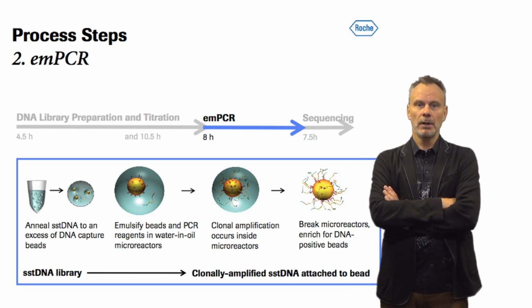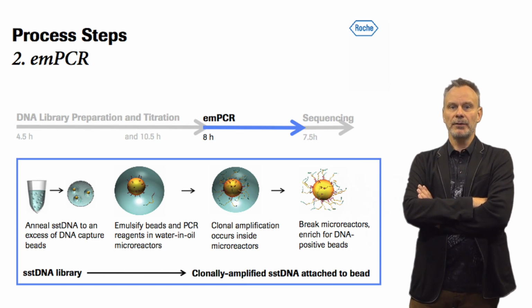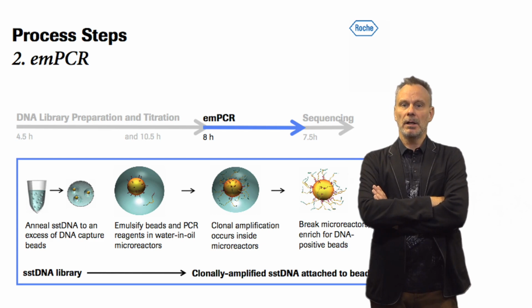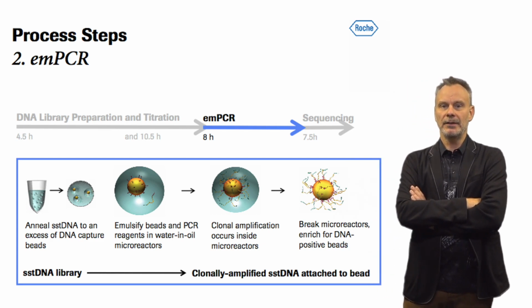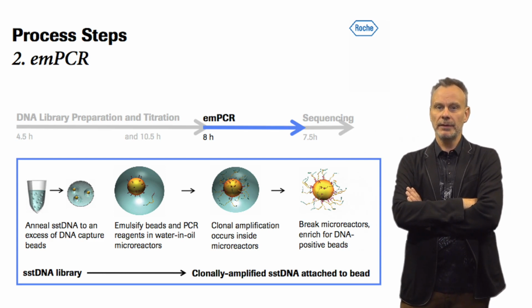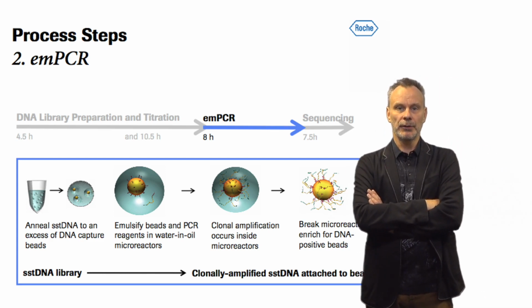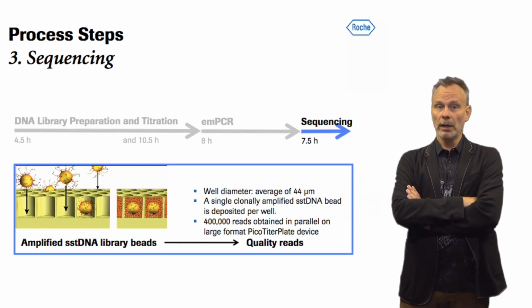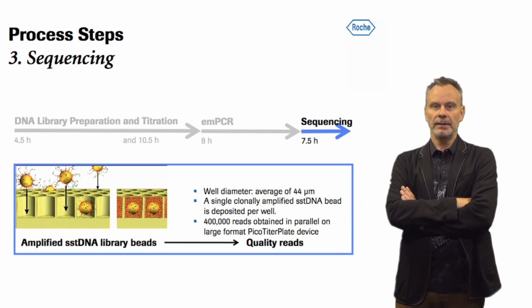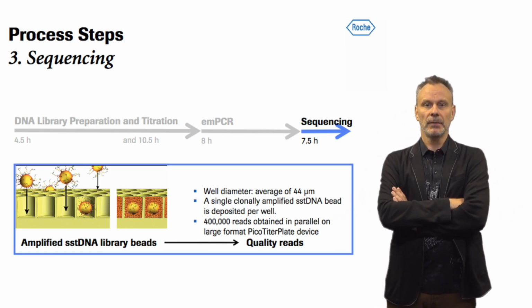Second-generation sequencing, also known as next-generation sequencing, represents a transformative leap from the original sequencing methods. Unlike the first-generation technique, NGS platforms can process millions to billions of DNA fragments simultaneously, drastically increasing throughput and decreasing cost per base. All NGS techniques share a fundamental principle. They sequence vast numbers of small DNA fragments in parallel.